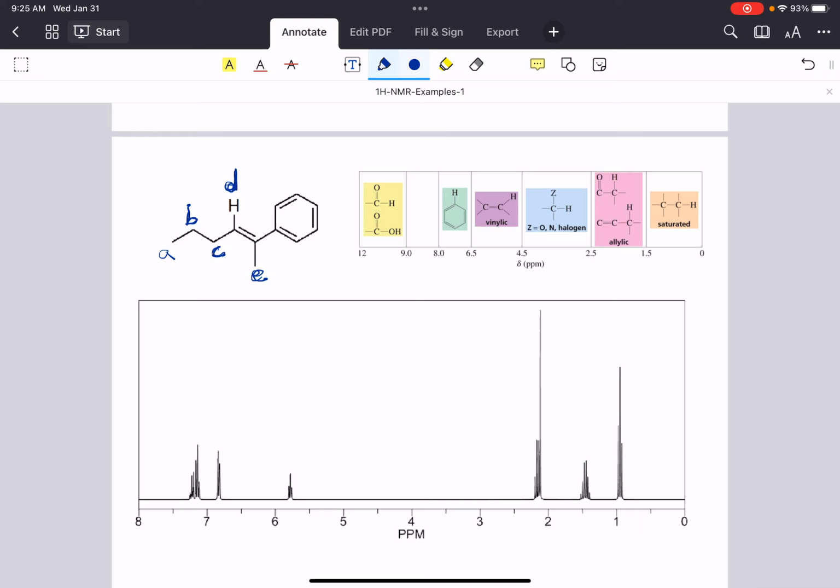And then we have a series of equivalent protons, F, on either side of this aromatic ring. G also are 2 equivalent signals, and signal H. Okay? And so those are the expected signals, the number of signals we would expect. And now let's see if we can pin down which ones are which based on expected splitting patterns and chemical shift.